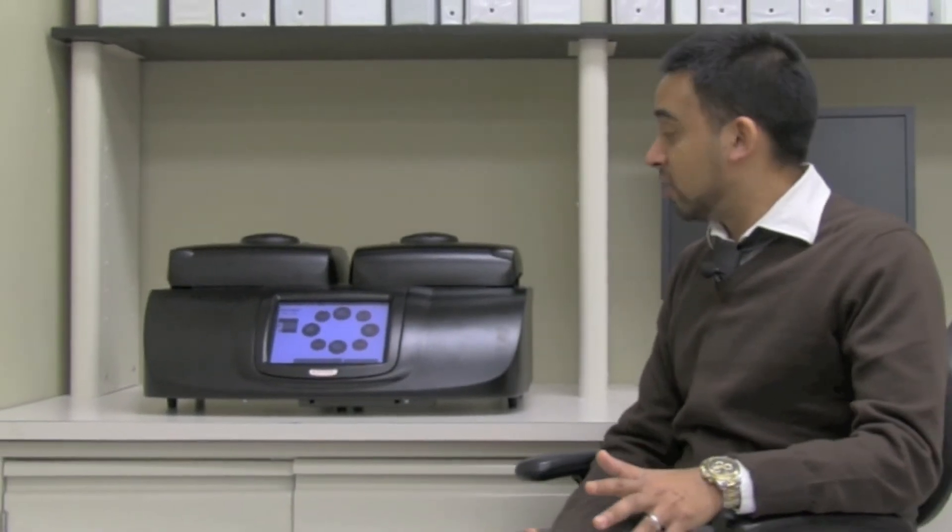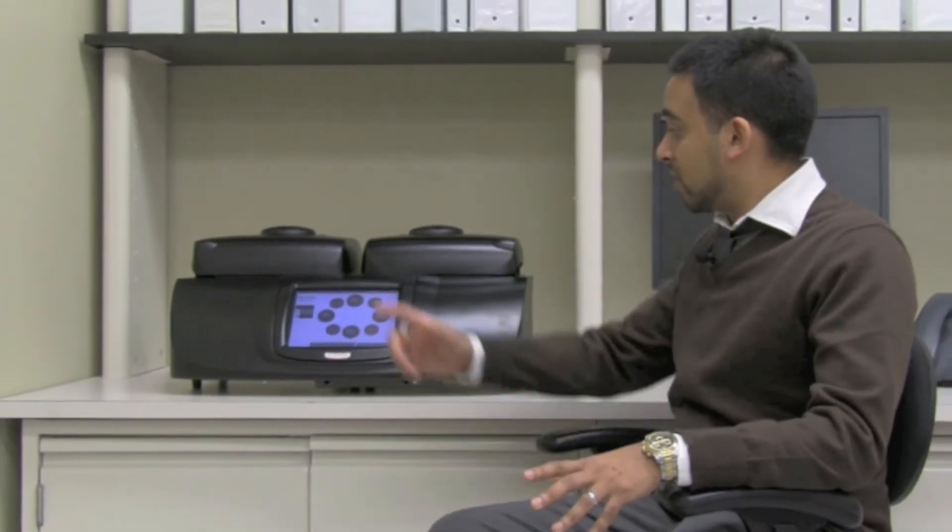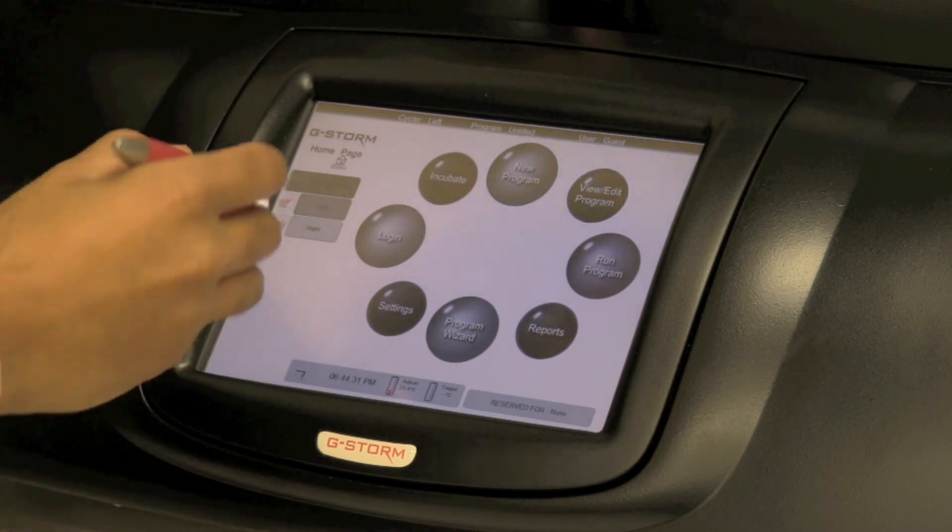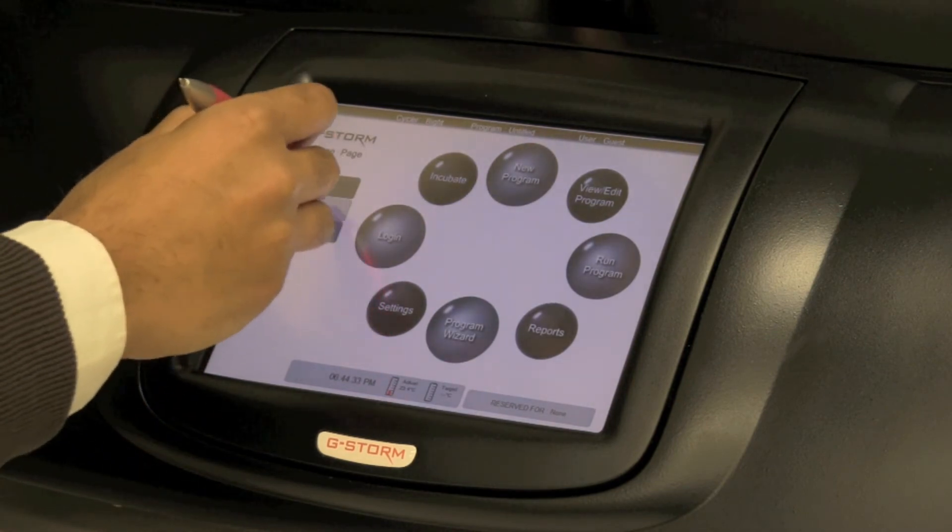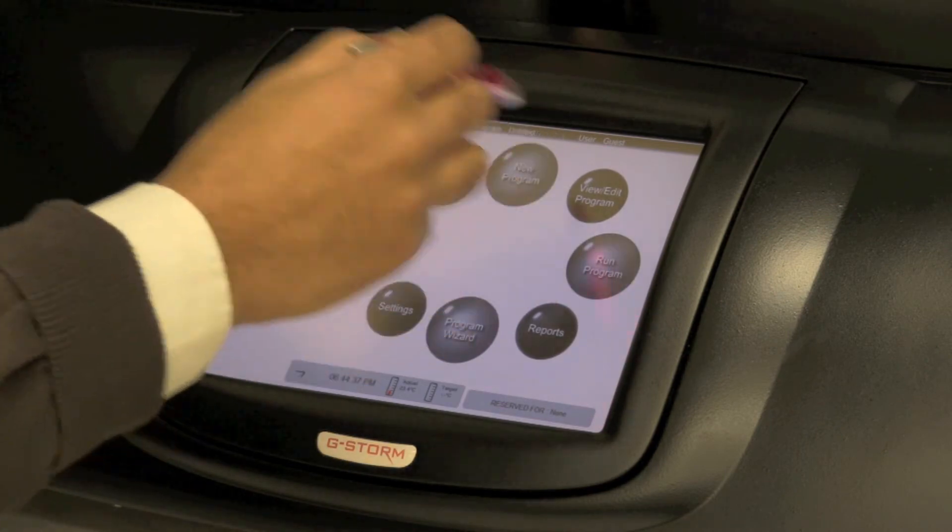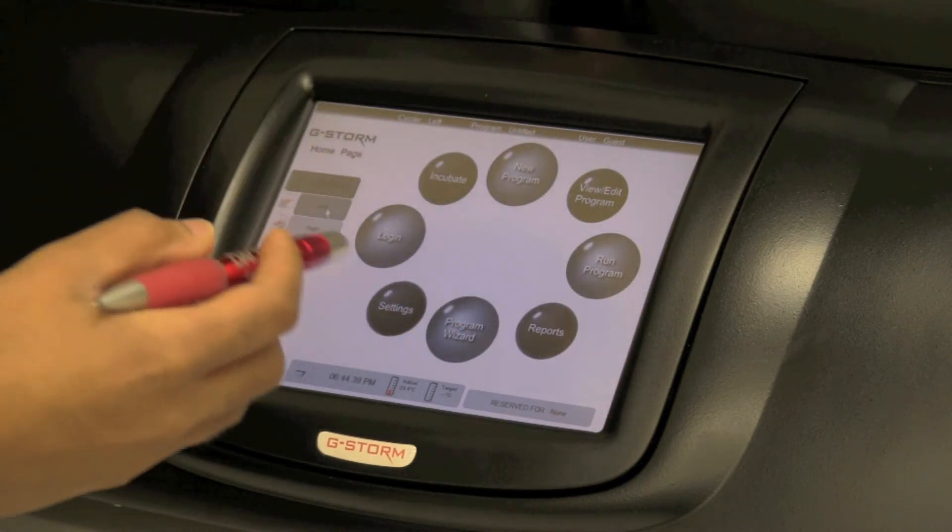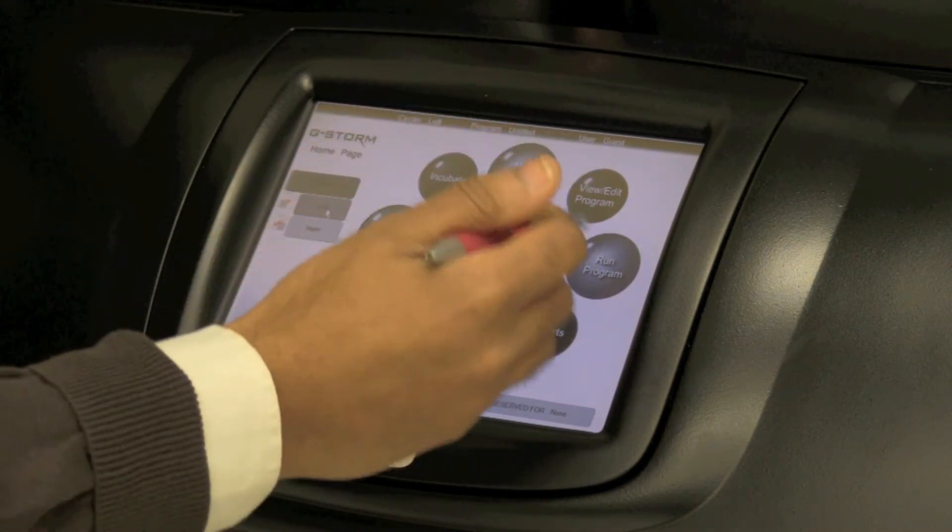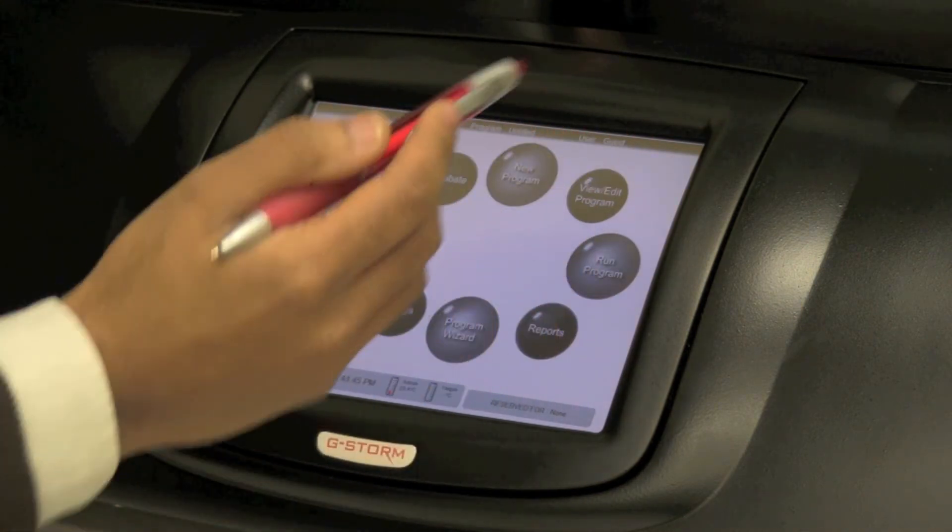Now that we're talking about the software, let's take a closer look at the large 8.4-inch touchscreen interface that we mentioned earlier. So here we have the home screen for the G-Storm GS2. We can quickly move between left and right block as simply as that. You can also see there's a number of options available to us. If we just take a few of these for example, we've got new program, view edit program, run program, reports and the program wizard.